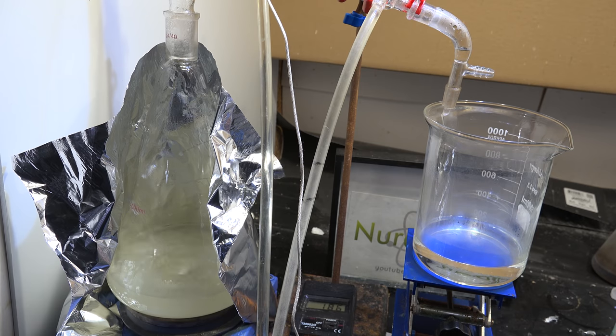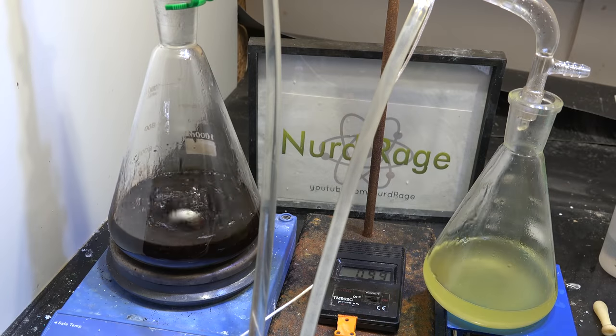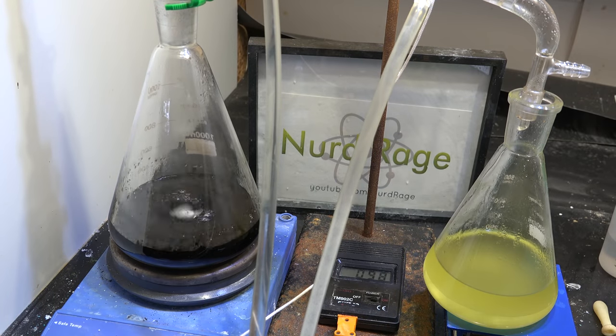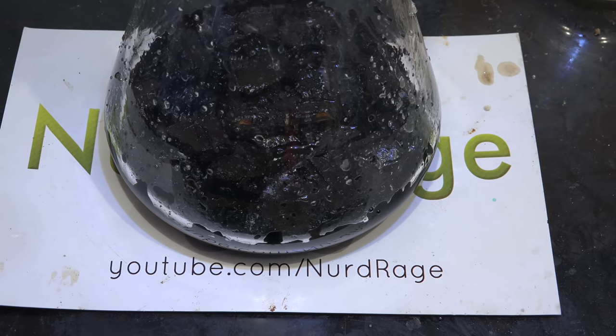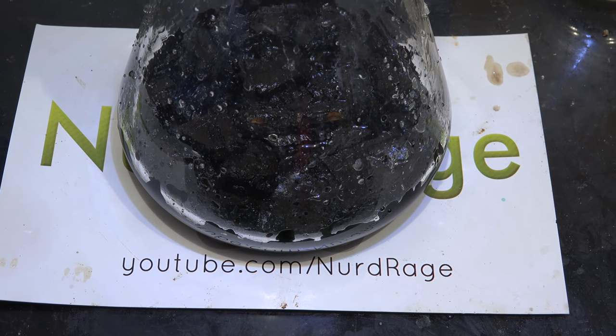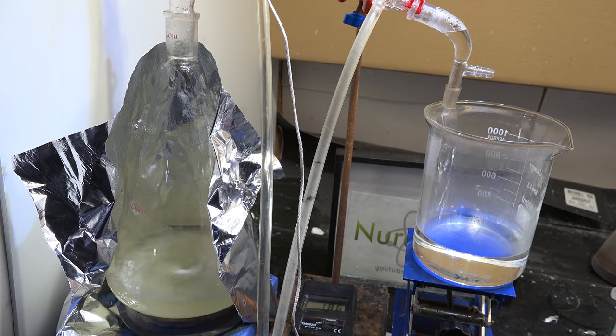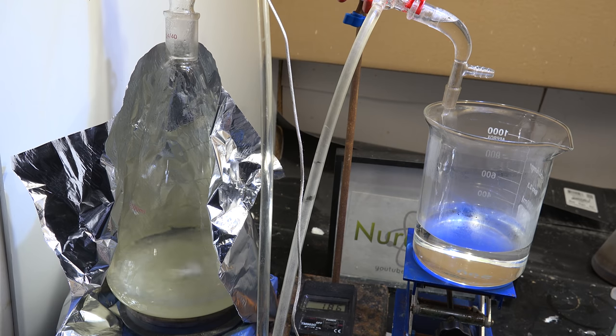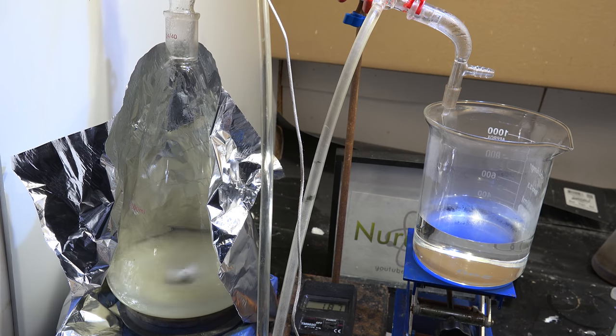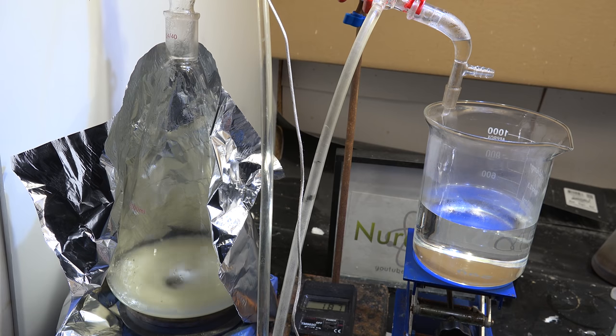Now you might be wondering why I'm going through this trouble of distillation. I actually tried producing dimethyl dioxane straight from antifreeze but the yield was terrible and there was a large amount of tar formation. Additives in the propylene glycol antifreeze presumably interfere with the synthesis. You can actually see these additives break down and precipitate out now as this white powder. Most dramatic is the red dye used to color the antifreeze is also breaking down. If you are using pure propylene glycol straight from electronic cigarette suppliers you can skip the distillation and go straight to making dimethyl dioxane.